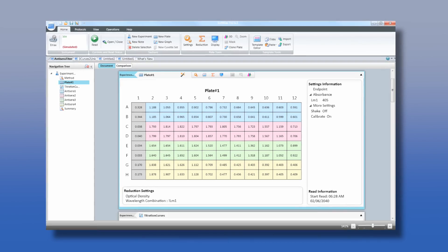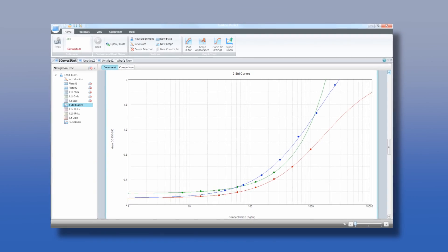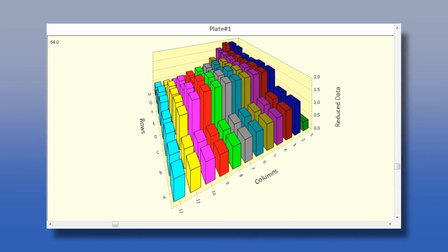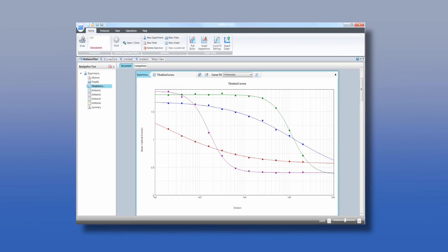The reader comes standard with the industry standard Softmax Pro data acquisition software, pre-loaded with over 140 protocols to get your lab up and running with ease.